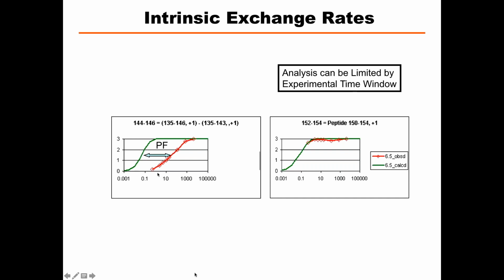That's easily determined, even with the time window shown here, with 10 seconds really being a practical limit for what we can measure in the laboratory time frame. So here we have a full curve, so you can really have accurate measurement of the protection factor.